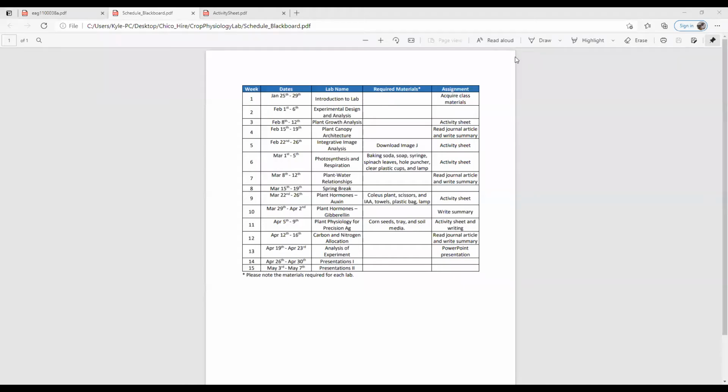Hello, class. This week and for the next 2 weeks, we're going to really focus on wrapping up the class with our plant physiology for precision agriculture lab. Now, we held off on this lab last week so y'all could finish up your plant hormone lab.